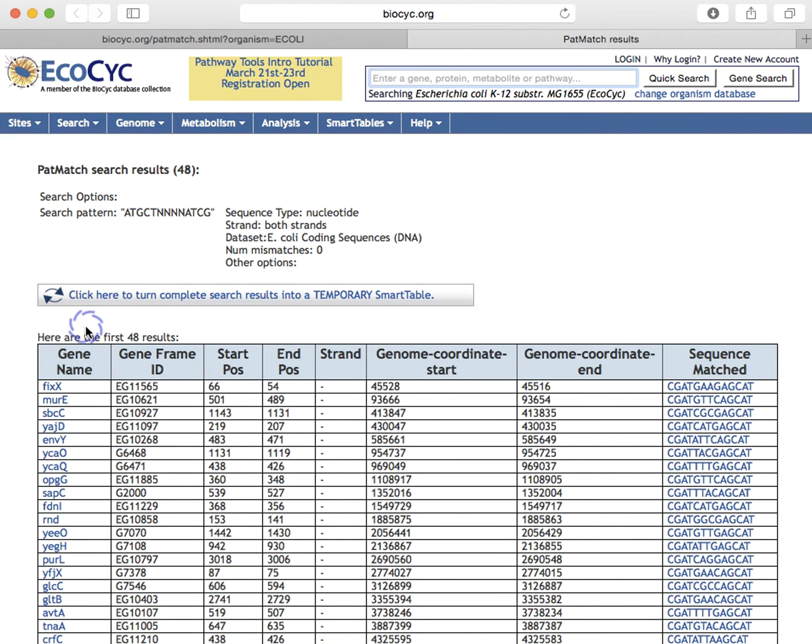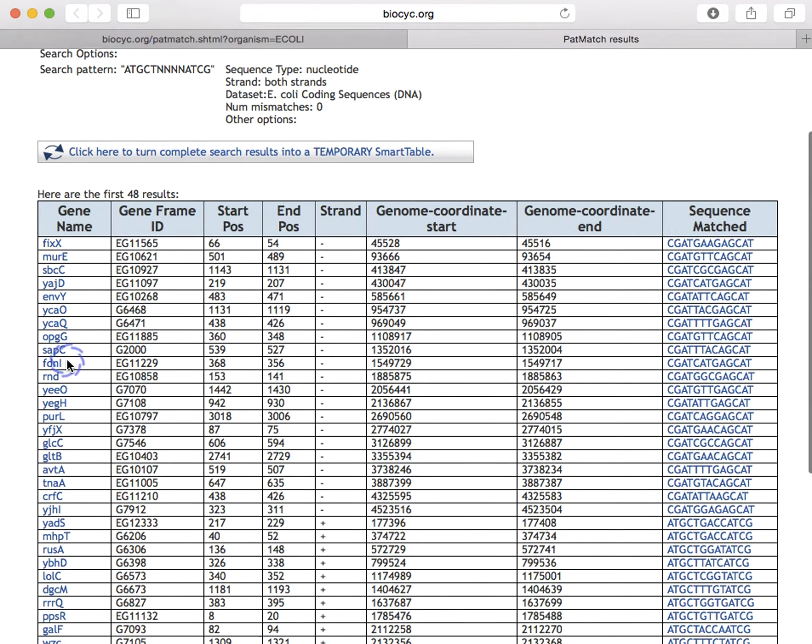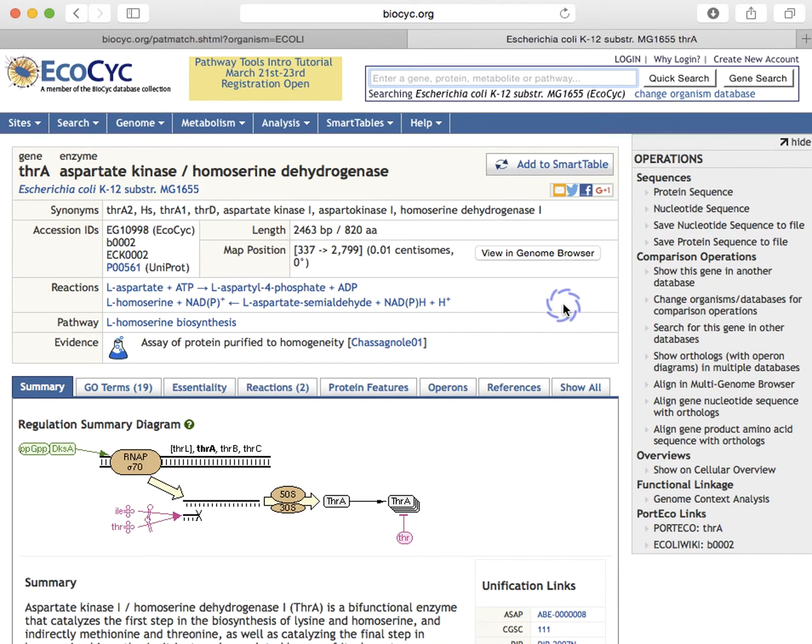And we'll see that we get 48 results, and each result is described in this table, and we can click through on the genes by clicking here.